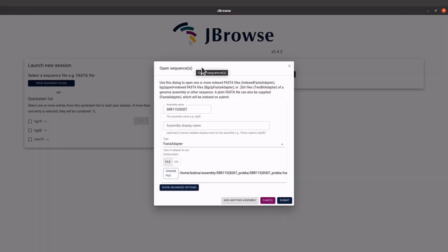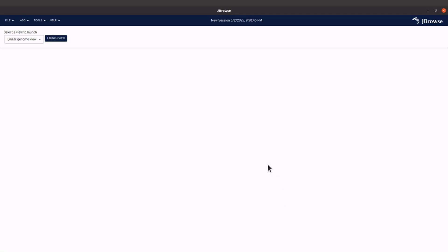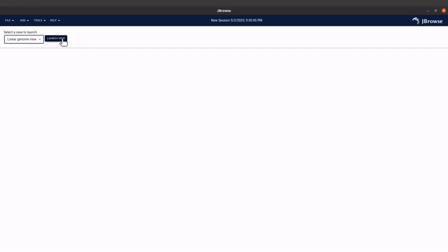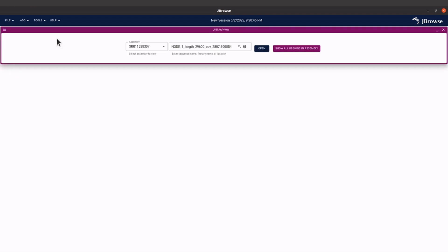That will open the file for us. Once you do that, come to 'Submit' and click it. You'll be given this window — when you are here, make sure the option selected is 'Linear Genome View'. There are other options but choose the Linear Genome View. Then click on 'Launch View' and you will be given this window. When you are here, click on 'Open'.